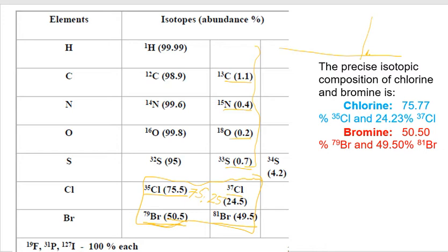Those are the isotopes of the elements which are present. When there are many oxygen atoms in the molecule, the isotopic peak due to oxygen will appear as a very small peak. When you have many carbons, the isotopic contribution of carbon is more, so you'll have a bigger peak.